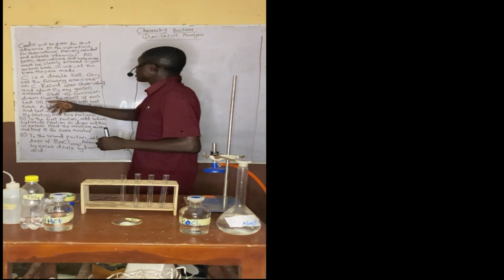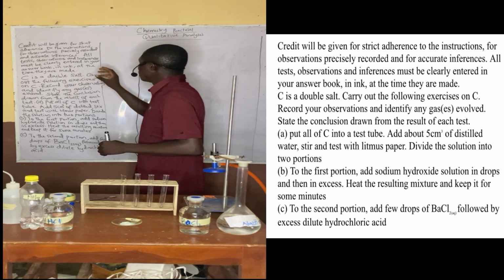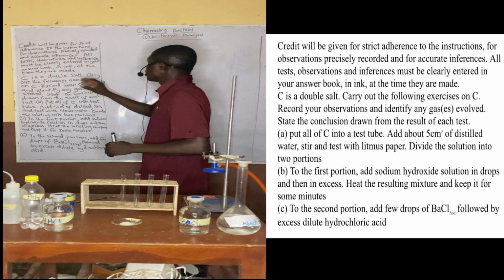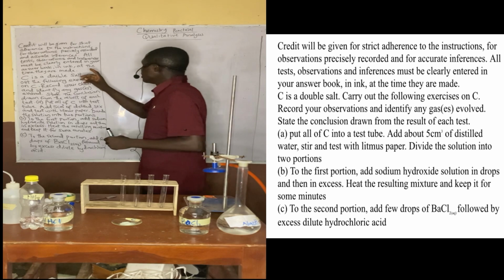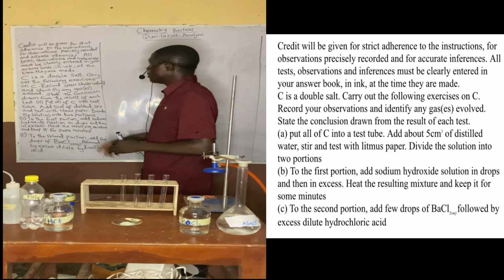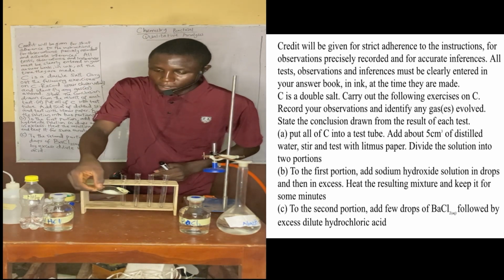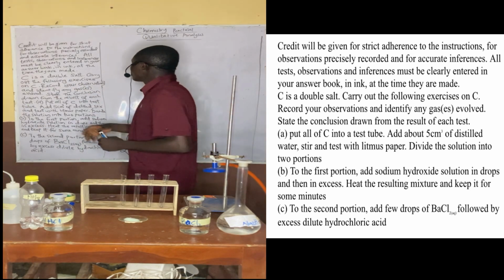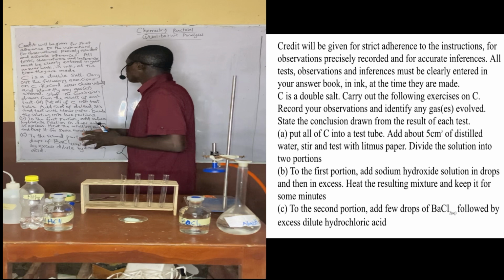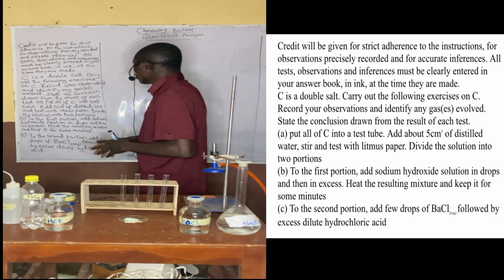Now, we are told that credit will be given for strict adherence to the instructions, for observations precisely recorded, and for accurate inference. All tests, observations, and inferences must be clearly entered in your answer book in ink at the time they are made. Now, C is a double salt. We can see C here, a green crystalline salt. It's a double salt. Carry out the following exercise on C. Record the observation and identify any gas or gases evolved. State the conclusion drawn from the result of each test.